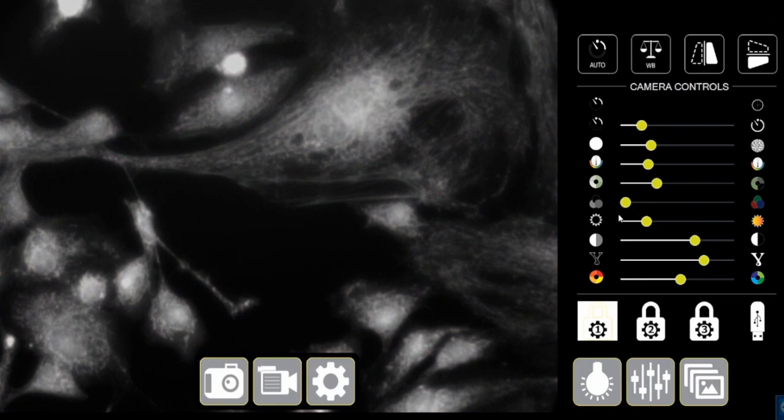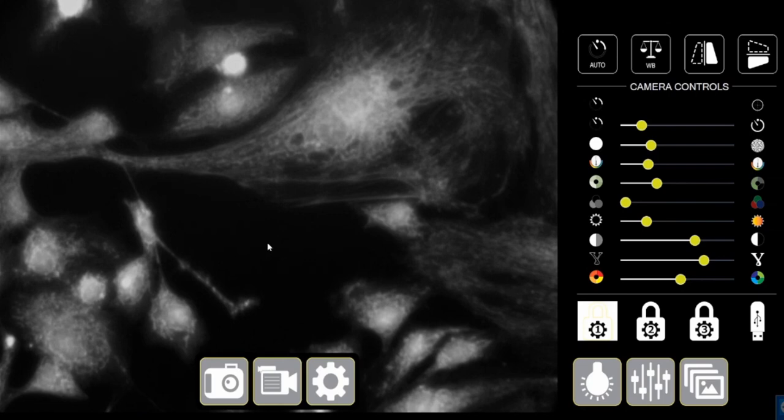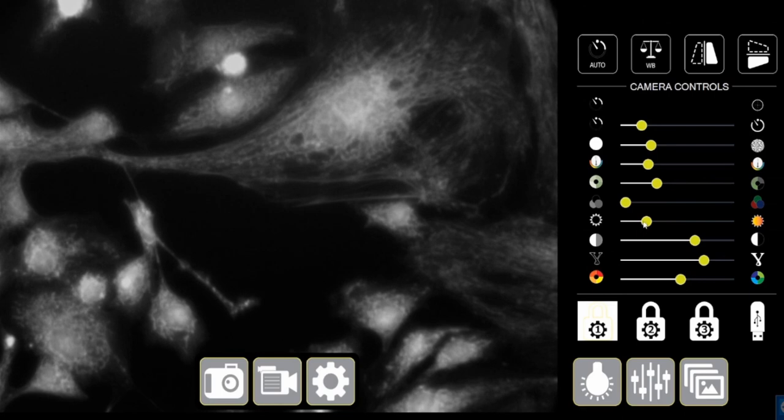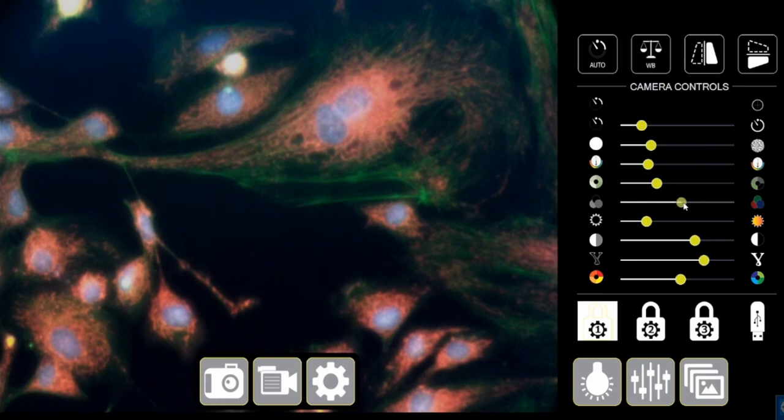There is no depth perception in the image. You don't know whether the nuclei is in the background or foreground. All that detailing is completely lost. And this is not a great image, so to speak, but you can have a real nice color live image. Why would you want to take a grayscale image?